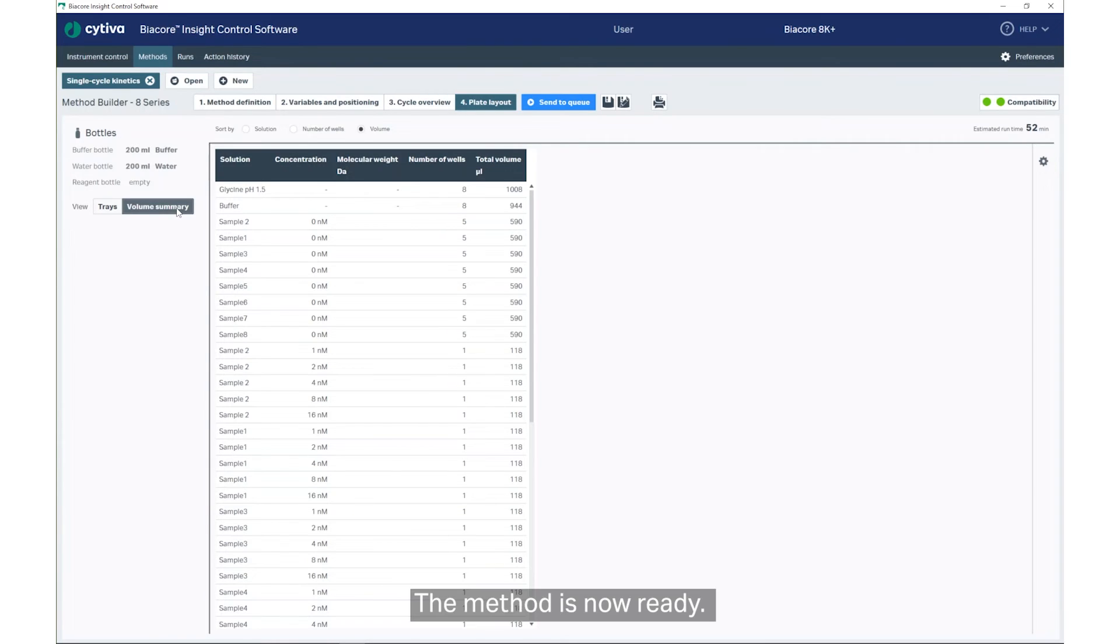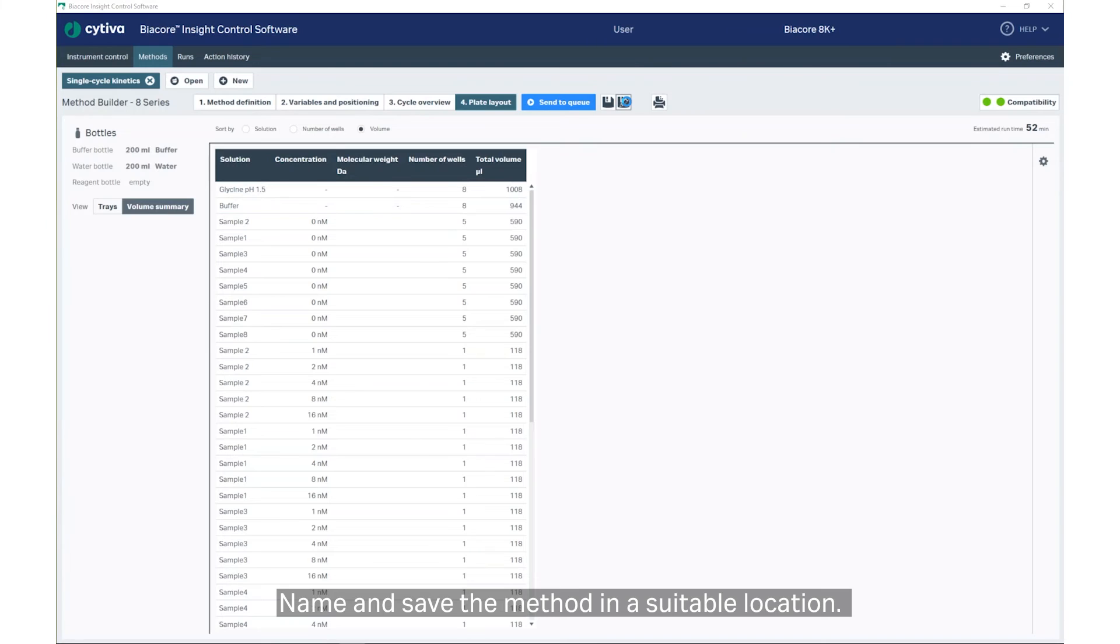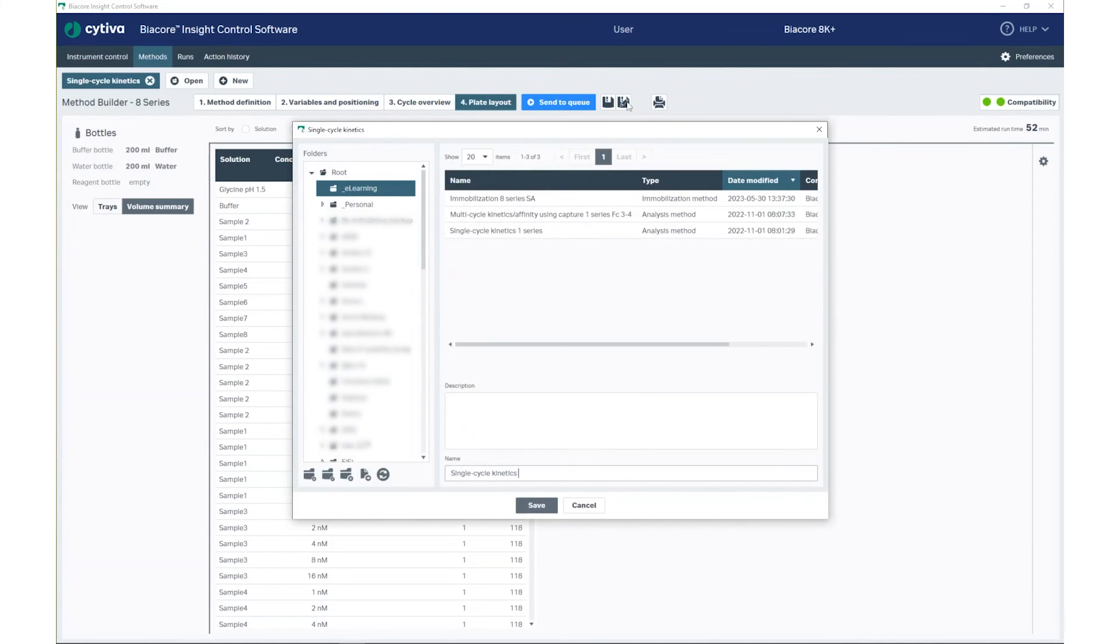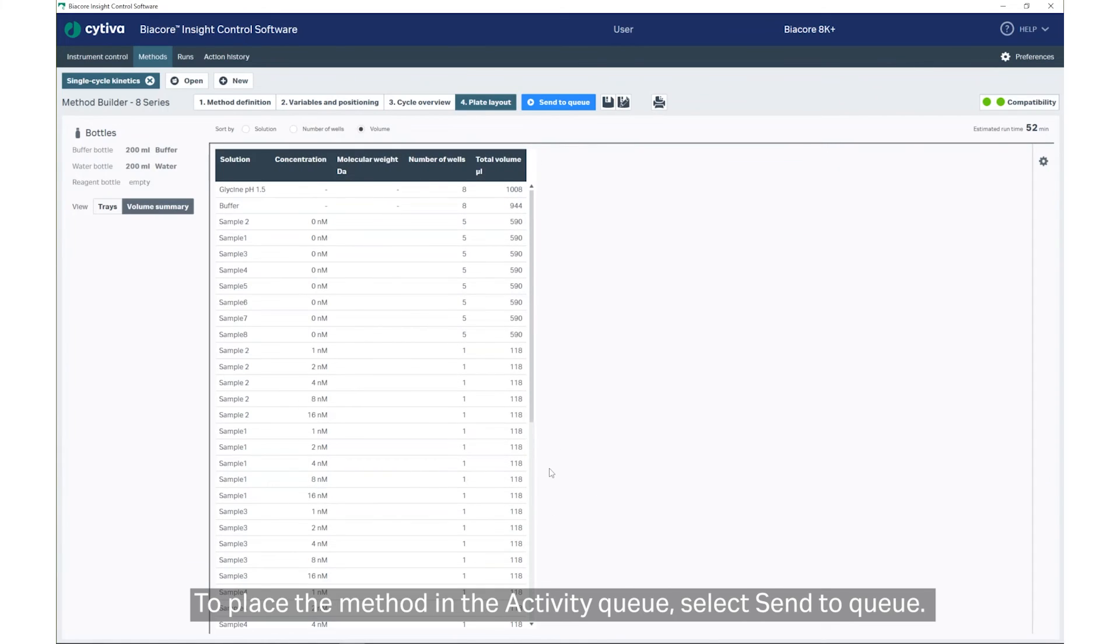The method is now ready. Name and save the method in a suitable location. To place the method in the Activity Queue, select Send to Queue.